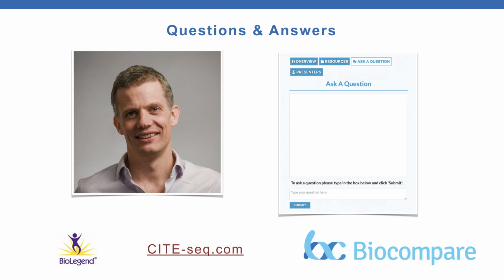These days, we seem to be working a lot more with BioLegend, who are doing a huge amount of work behind the scenes in actually getting the concentrations right and working on developing panels that are pre-titrated. So hopefully a lot of that will be taken out of the hands of the actual experimenters at some point in the near future.